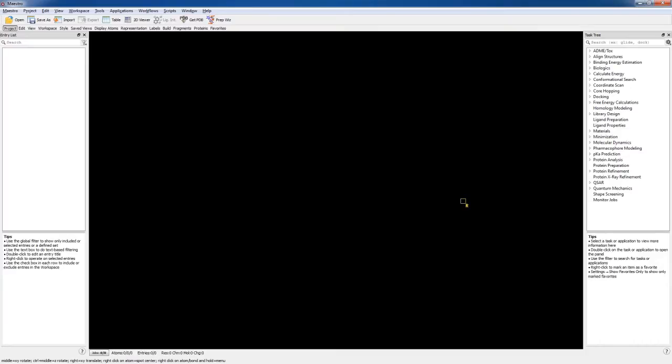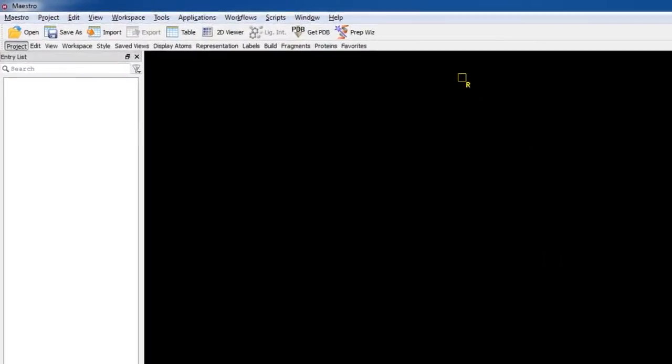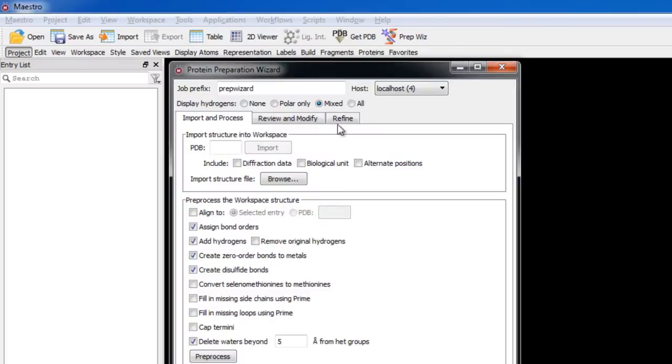In this video exercise we'll use the System Builder panel to build a model system for the streptavidin and biotin complex 1MK5 in a 0.15 molar sodium chloride solution for use in subsequent molecular dynamic simulations using Desmond. The first step is to download and prepare the protein, so let's launch the Protein Preparation Wizard panel, then type 1MK5 and click Import.